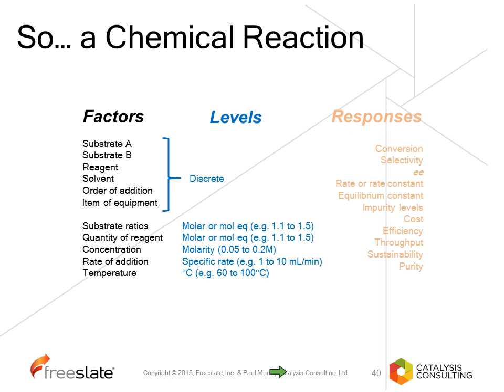So for a chemical reaction, we have a number of factors. So those are the substrates, the nucleophiles, the leaving groups, the bases, the solvents. The equipment that we carry out the experiment in, whether it's done in batch or flow, and the order of addition of materials together. These factors are discrete, and these factors are more difficult to control and to understand in experimental design.